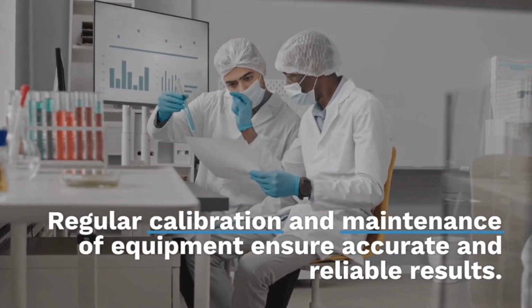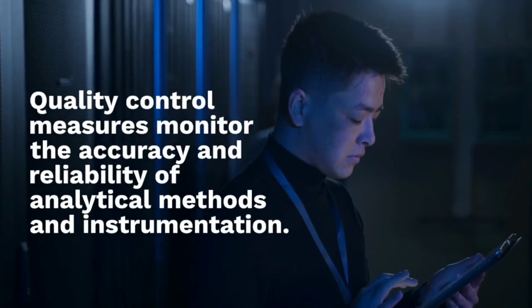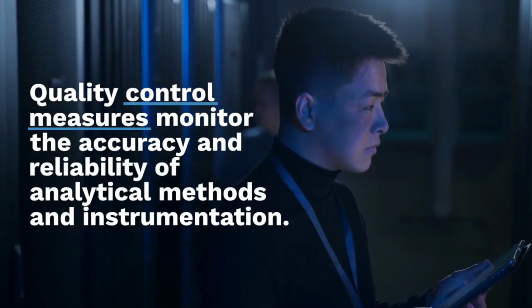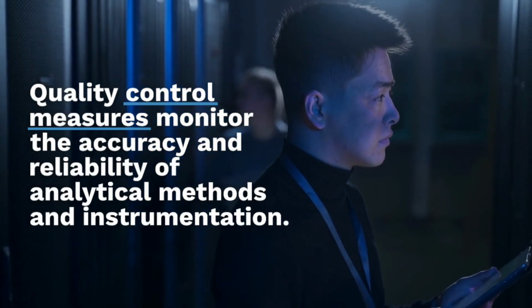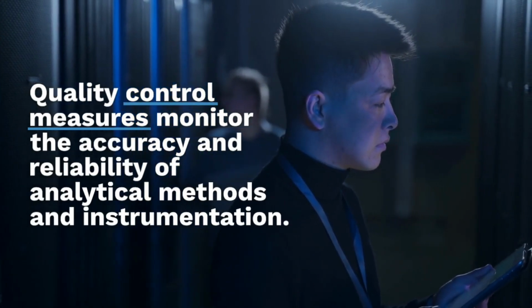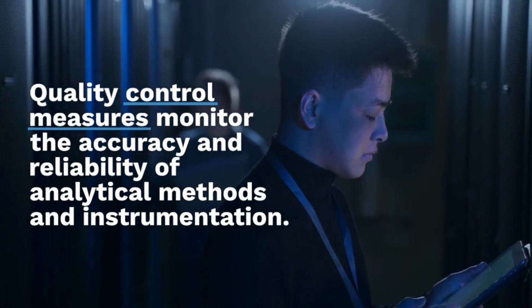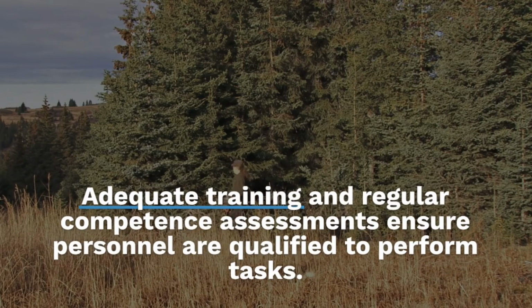5. Quality control and quality assurance. Laboratories should have quality control measures in place to monitor the accuracy and reliability of analytical methods and instrumentation. This may involve running control samples, performing quality checks, and participating in proficiency testing programs. Quality assurance activities, such as internal audits and review processes, can help identify and address any deviations or non-compliance with established procedures.